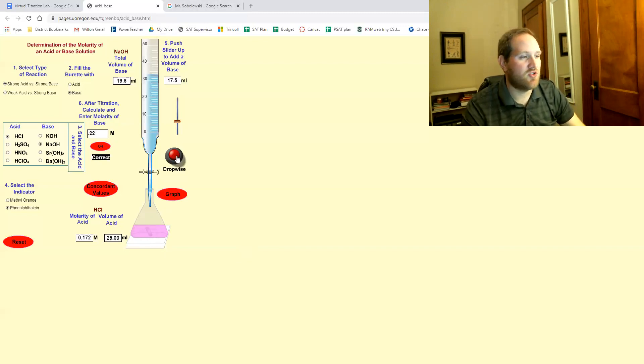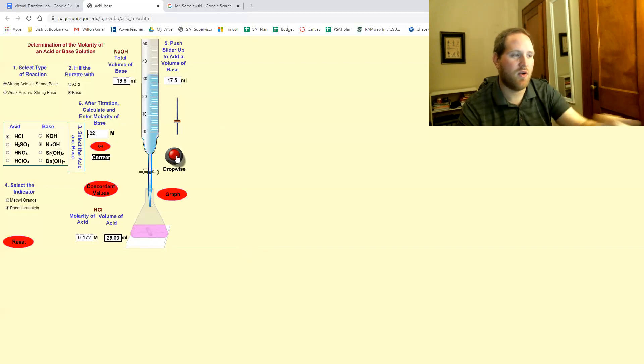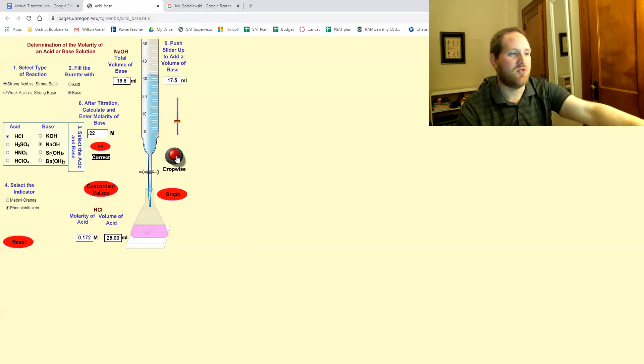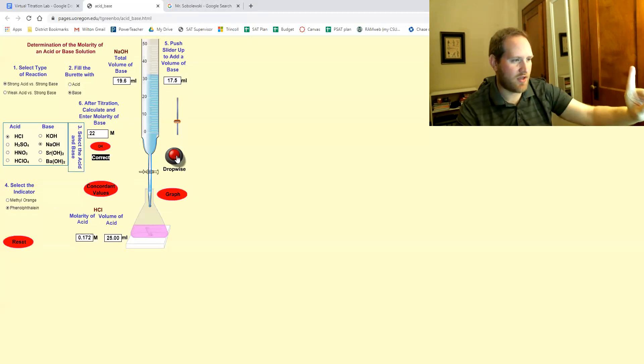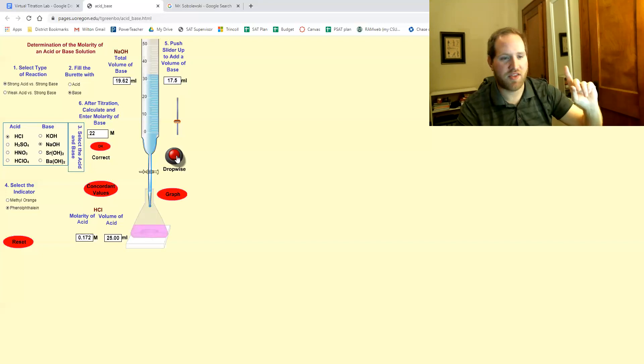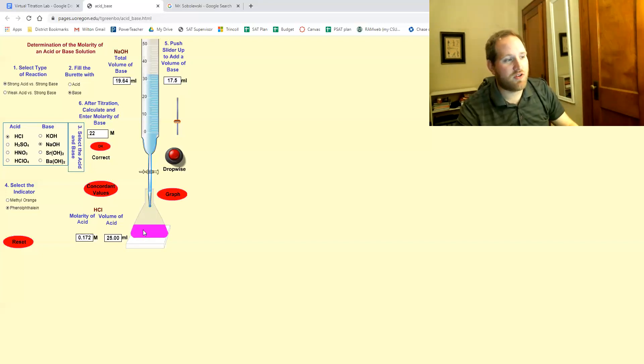If you accidentally overshoot it, which by the way, remember I said you have a three drop grace window. I did two drops, one more drop. I think I'm still okay. One more drop. I think I'm over. Yeah.